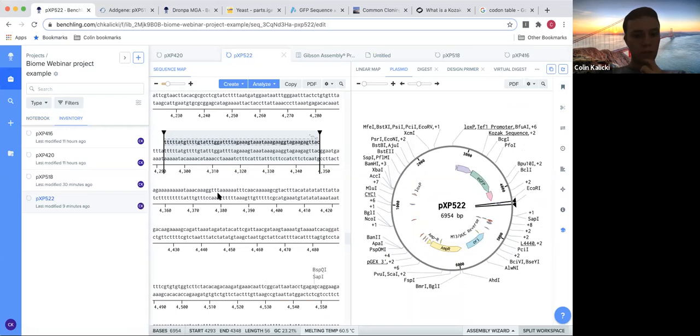That's a good question. A lot of times, before you introduce the restriction enzyme, you mix it along with the gene you want to insert in there. And then you're running an odds game here, right? If you insert enough genes, it should bind enough.